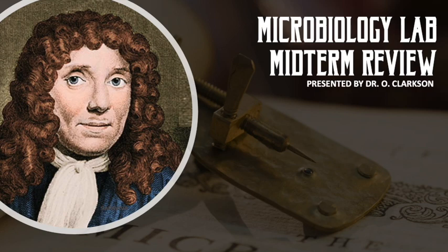Staining. So after you prepare your slide, then you're going to stain, right? We have a couple different stains. We have simple stains, and then we have differential stains. What are the two simple stains that we've used? In our class we use methylene blue. You can use safranin, crystal violet. Methylene blue and safranin are going to be the two most common ones. But what are those called? What's the electrical charge of those stains? Positive. So those are positive stains, right?